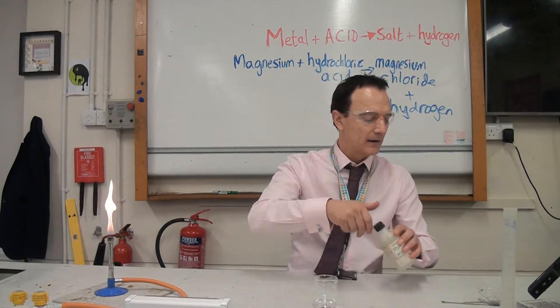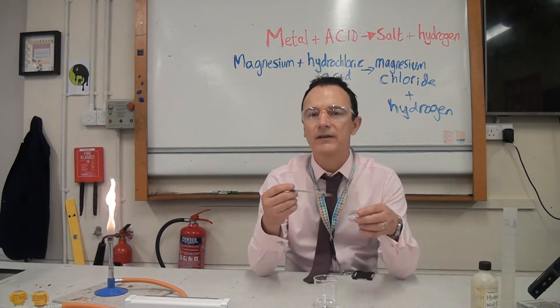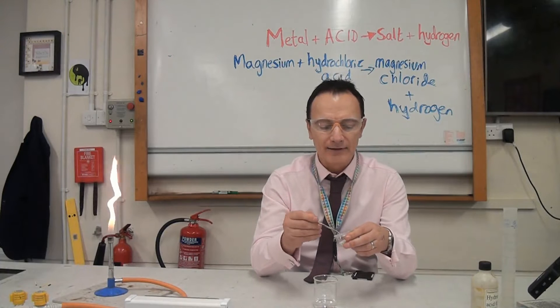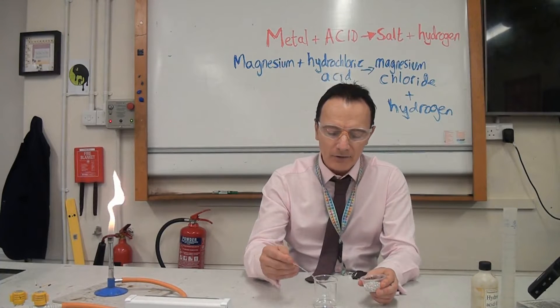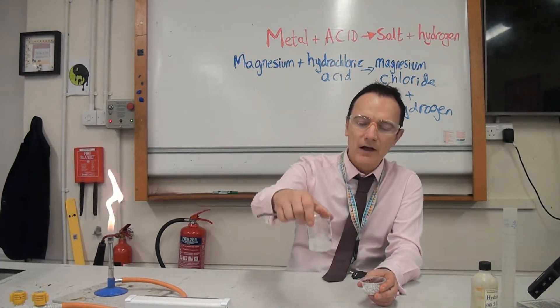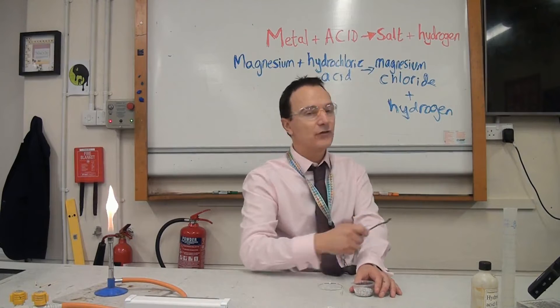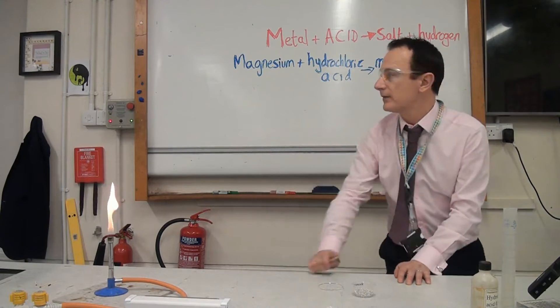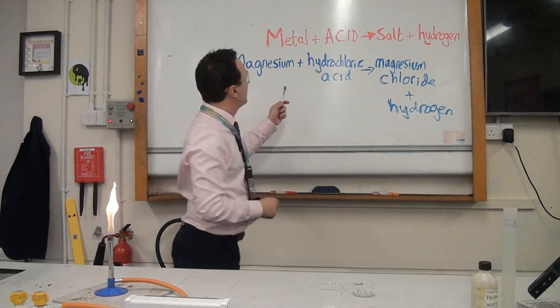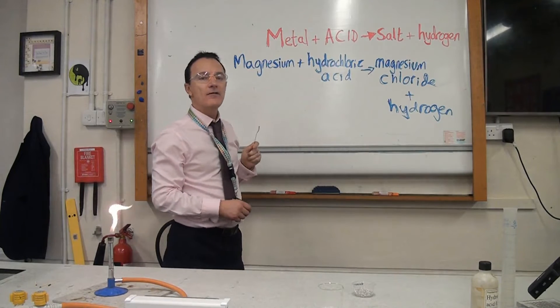Then I'm going to add the metal. In this case I'm using magnesium, which will work because it's higher than hydrogen on the reactivity series. I add a small amount of the metal, and we can see it's starting to react — it's starting to fizz, making hydrogen gas.